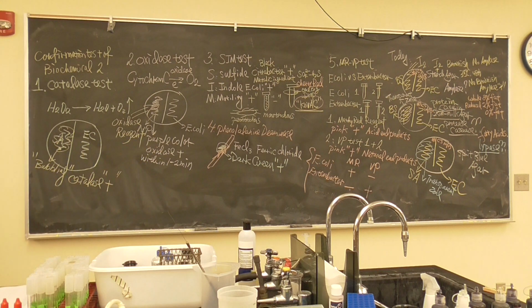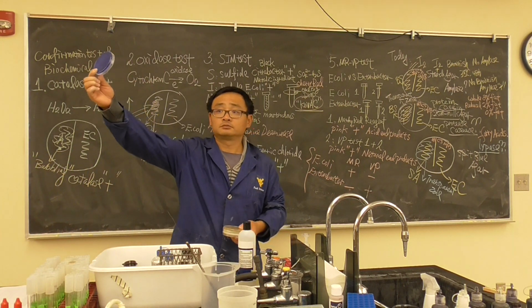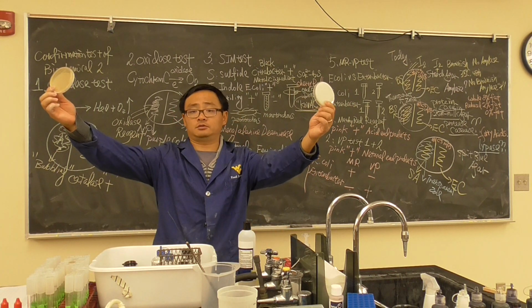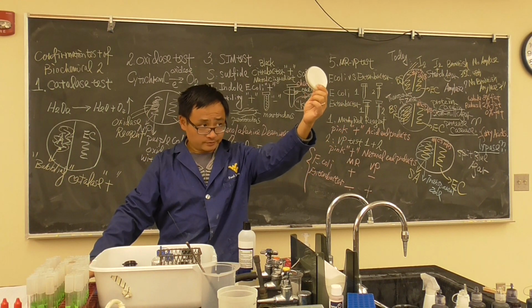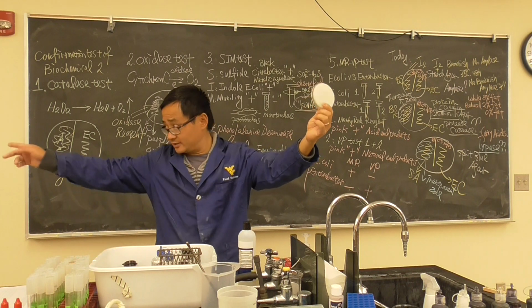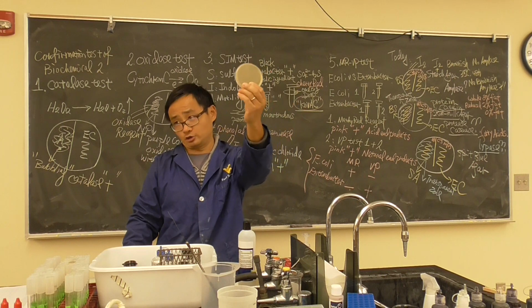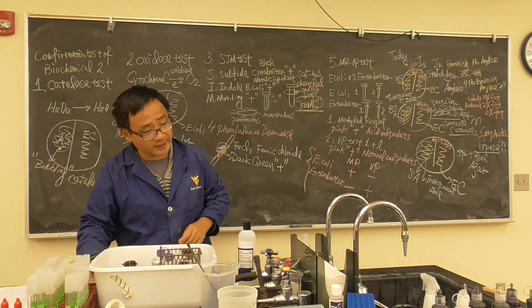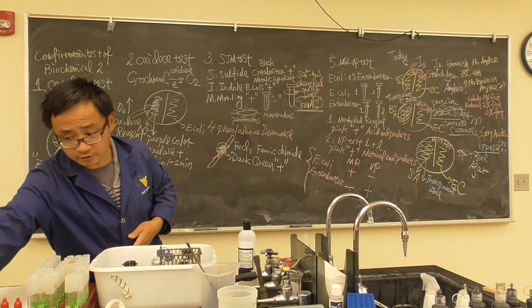Okay, let me show you all these. What it looks like. Spirit blue agar. We already said it's spirit blue. Of course it's blue. It's so simple. Which one is the skim milk agar? You tell me. Yeah, the milk. Very white. Okay, so you don't have to label in there. You can go back to the bench to label. And this is very similar to our general agar. It's a starch agar. Okay, so it's very clear. I really like this test. It's very simple and straightforward, but tells us lots of information compared to all the other work.